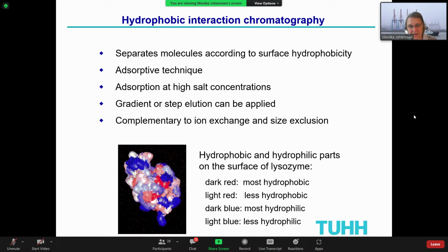So it's quite important to take care about it. It means that you always have to check if your conditions are constant, or if your efficiency is decreasing, and then at the latest at that point, you should do an extra washing step, for example a cleaning step, or change the material.